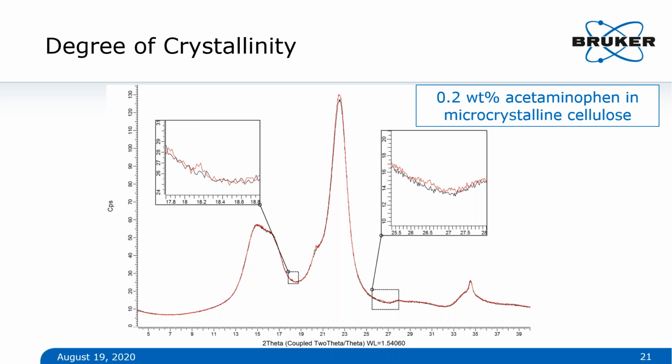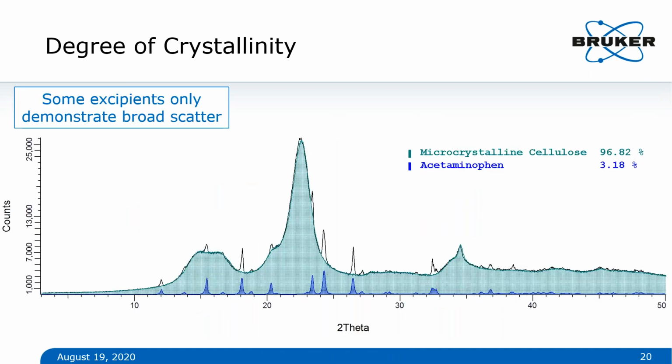The data shown on the screen is, I guess, a little bit of a challenge case, right? We wanted to see how low can you actually detect it. By the time you're out here at, say, a couple of weight percent, so 3 to 4 to 5 weight percent, if you've got a crystalline phase, you know, because you see a sharp peak coming out of your background.